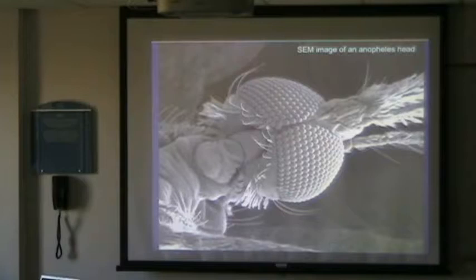They typically get to about 30 to 40 angstroms, but they don't really get to clear molecular resolution. And regular SEMs are maybe 10 or 20 nanometers in resolution. So that's good and right for these kinds of things, but it's not enough for actually getting molecular resolution.